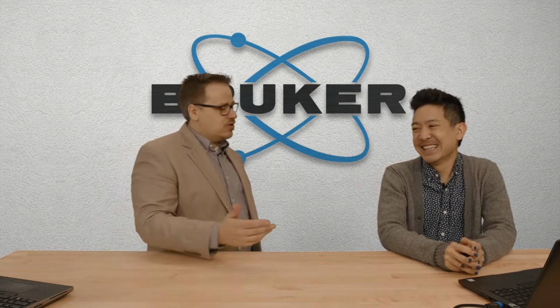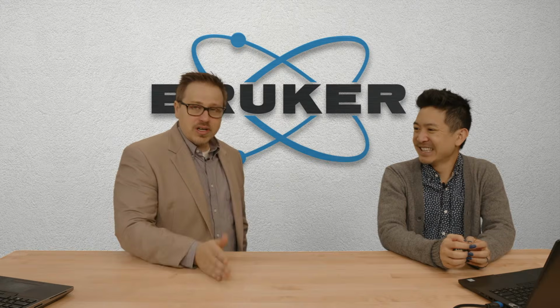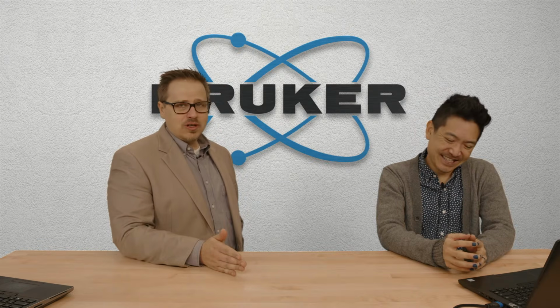Very easy, right? And in metals, in a foundry, this really influences grain size, ductility, things like that. So knowing it's Monday on Monday, first thing in the morning, that's a great thing. And that's actually where we would use user databases. It's a really great tool. I find it's also very useful for exploratory or, as I said earlier, customized things, like new materials.